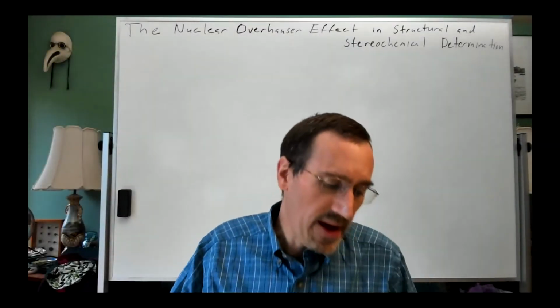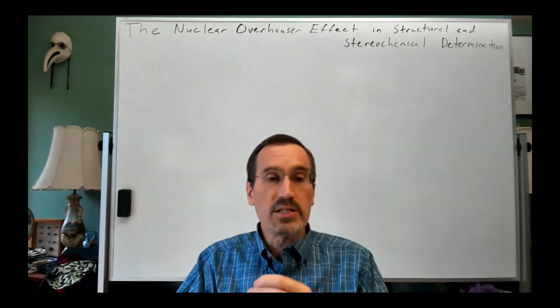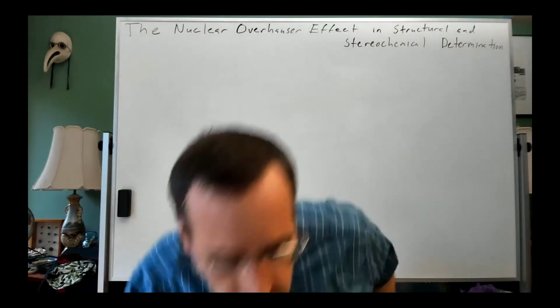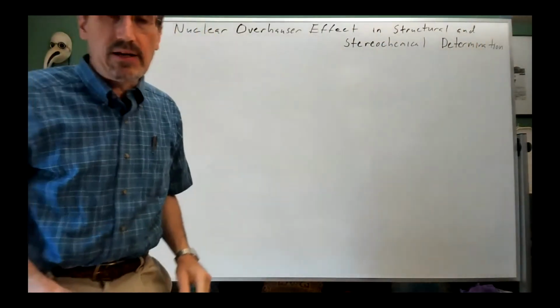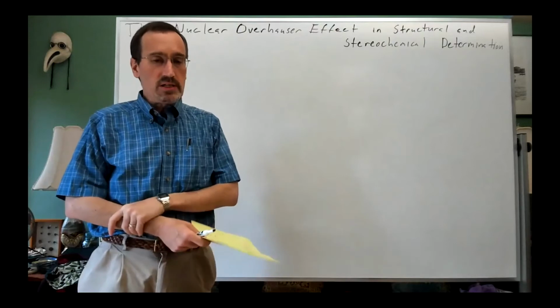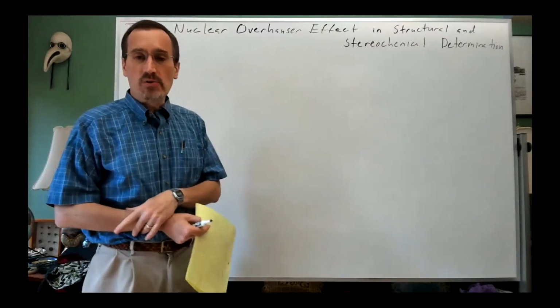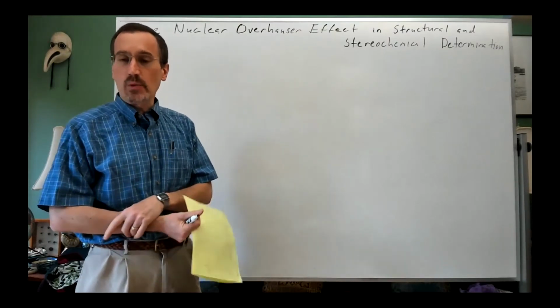So what I'd like to talk about today is the nuclear Overhauser effect and its application to stereochemical and structure, particularly conformation, but structure determination. I wanted to start, this is a fantastically useful technique, particularly if you're making molecules or otherwise asking specific questions on stereochemistry. And one of the things that I've emphasized in the class is that we don't typically just have an unknown sample plopped in front of us in our research and have to answer what is it.